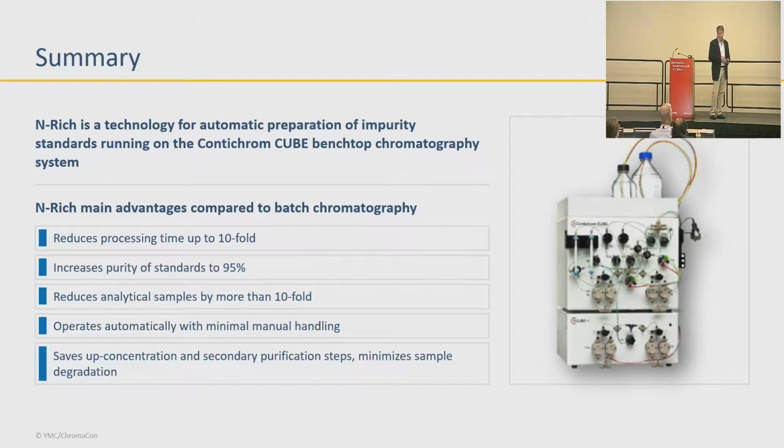So to summarize where we're at, it's a technology we like to say is fully automated, but you have some development and you have to be there for it to start, but it does run overnight. It's got loading pumps and fraction collectors, and if you're comfortable leaving liquid flowing in your lab overnight without somebody there, as most of us do, then you can let it go.